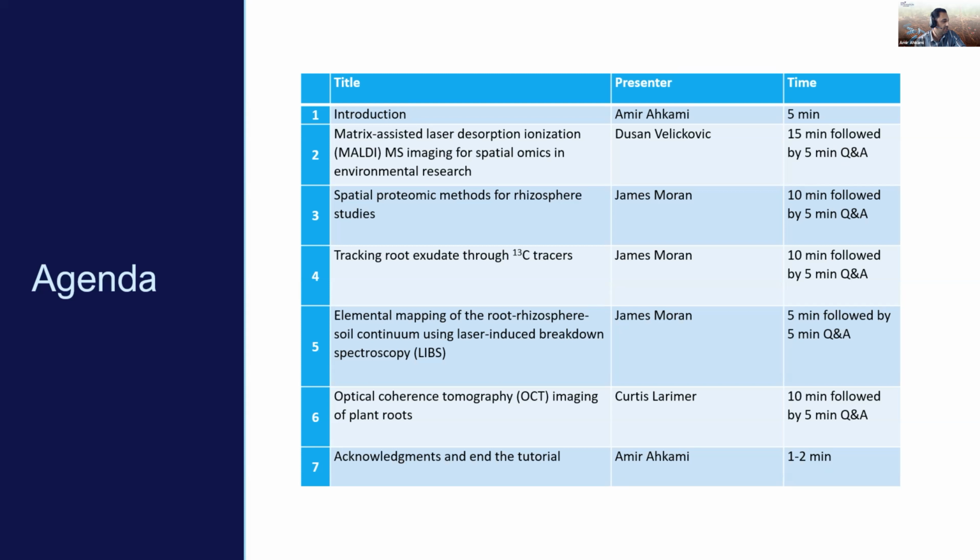The last part of the tutorial will be by Curtis, which will mainly focus on optical coherence tomography, or OCT, imaging of plant roots. We hope that this tutorial provides some very good fundamental information for current users or even future users to start working with us.